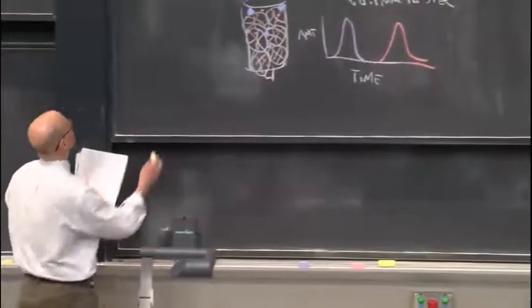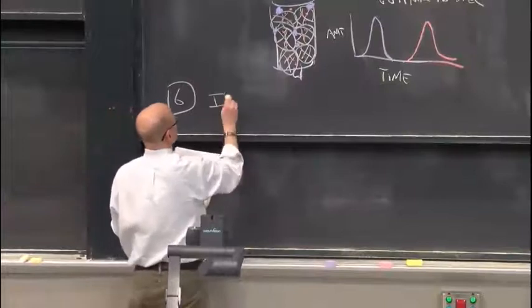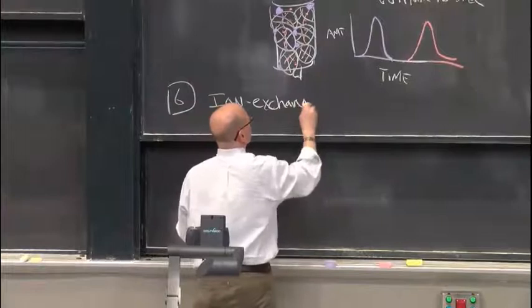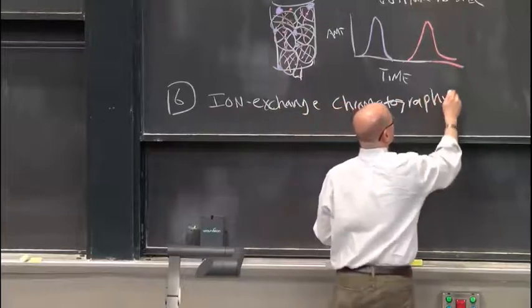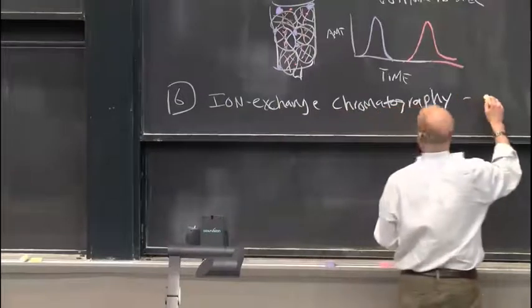How about separation based on charge? I can do that too, and the technique I'm going to use to separate based on charge is called ion exchange chromatography. Ion exchange chromatography. Now remember, it separates based on charge.